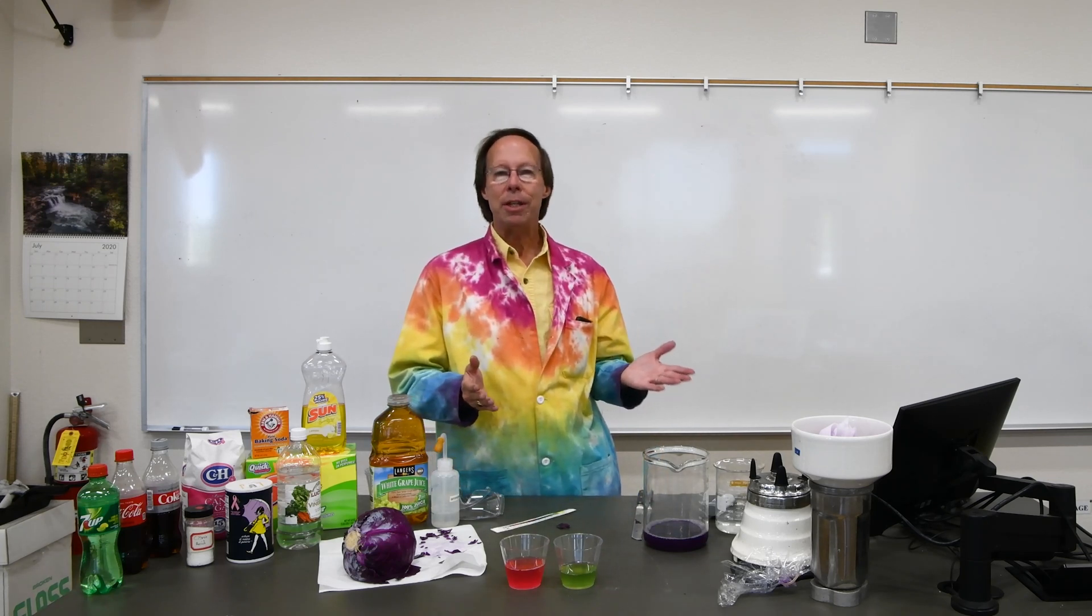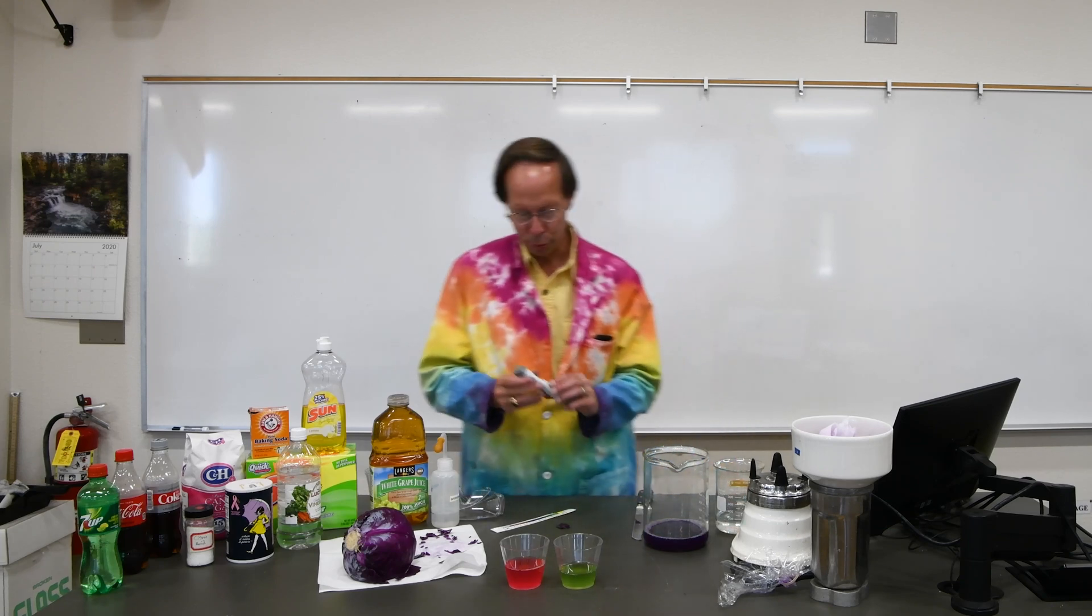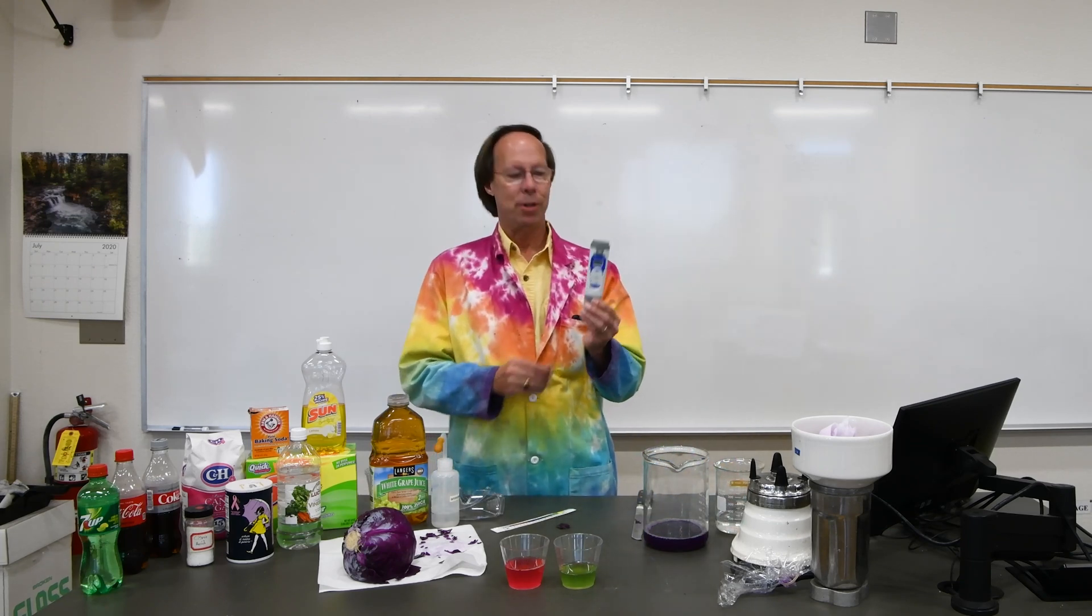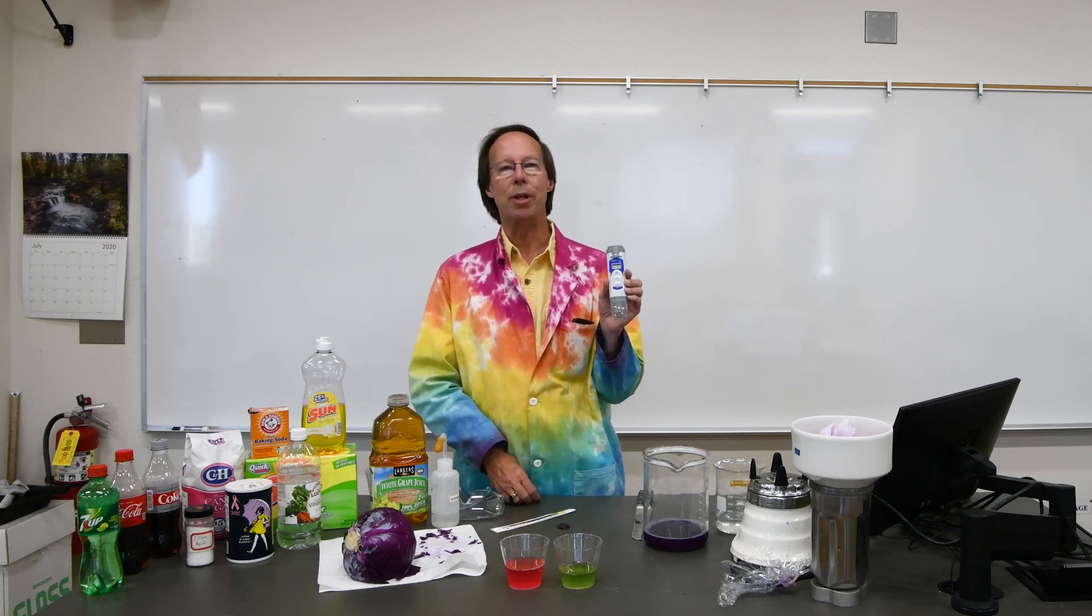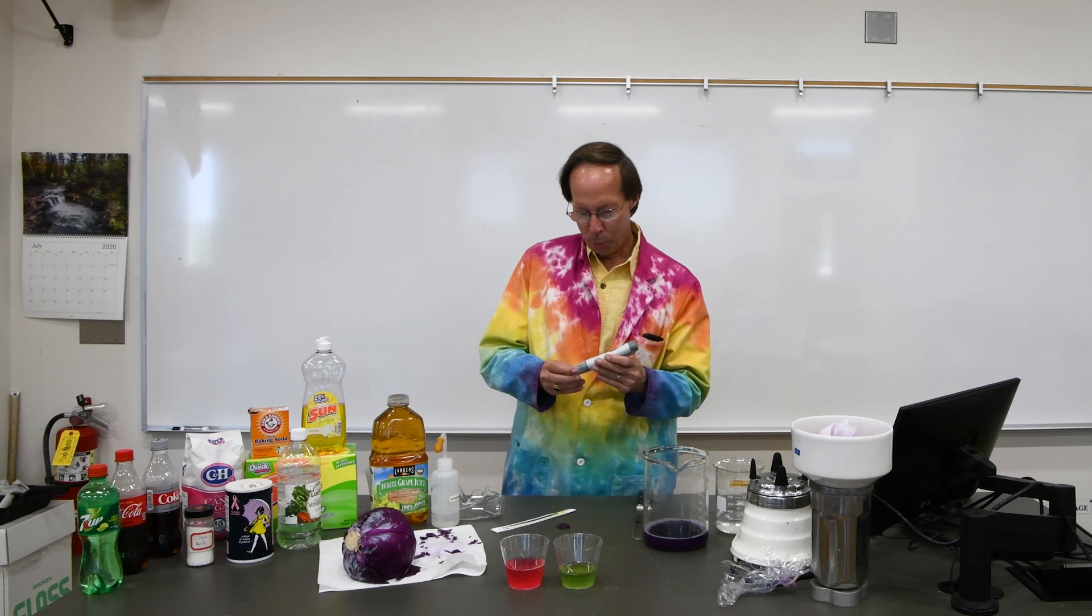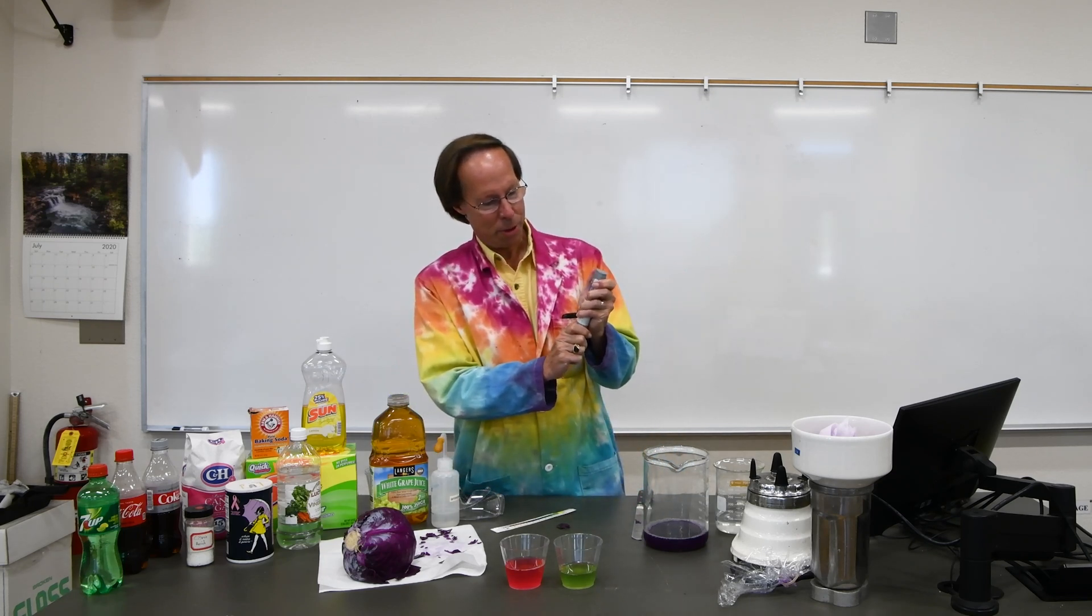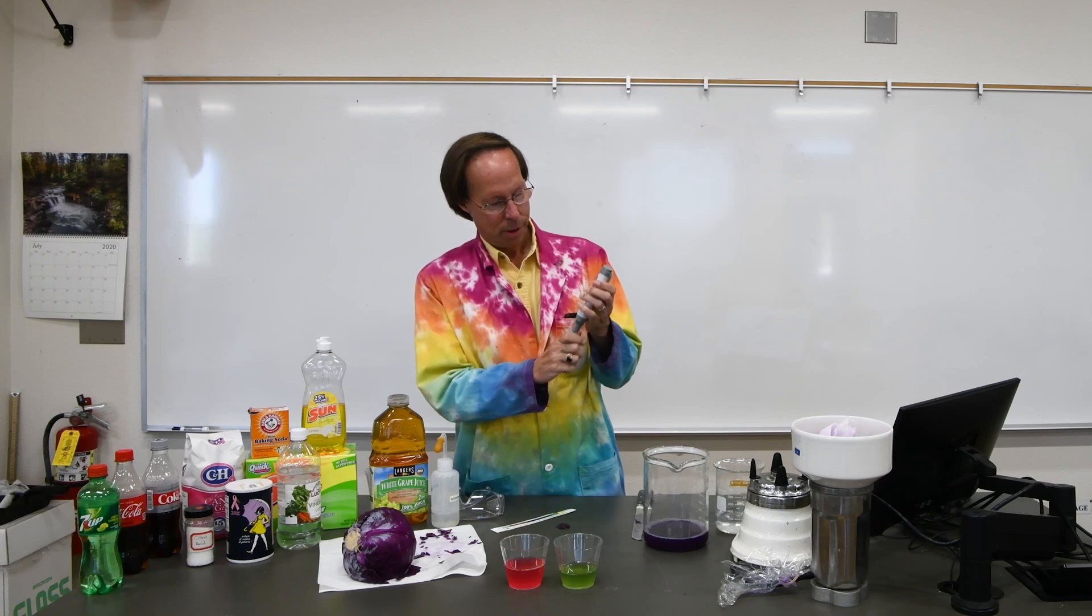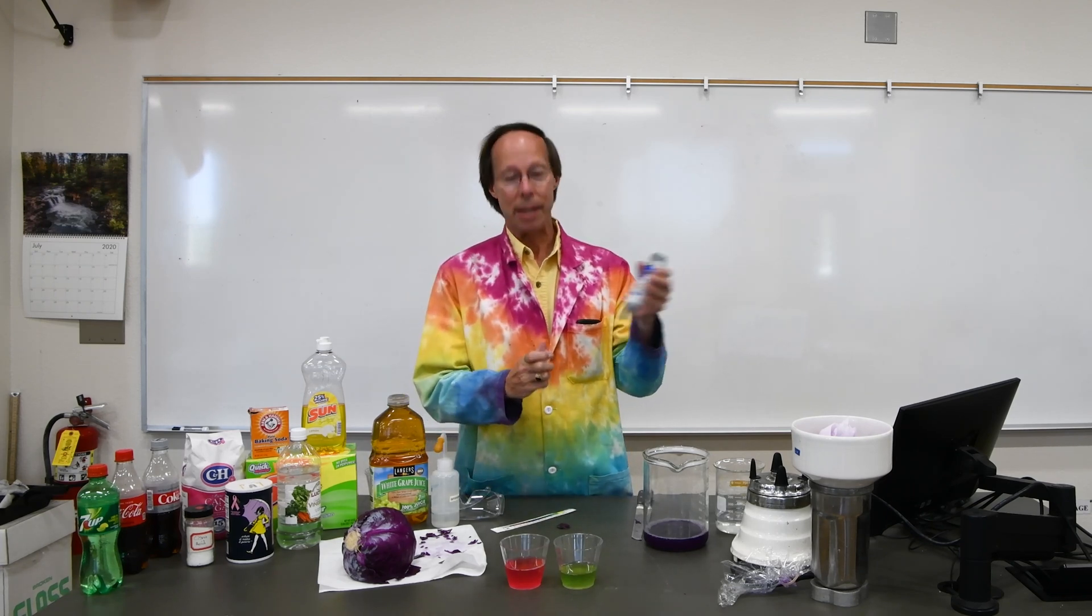After we finish with the 10 cabbage juice tests, we're going to go ahead and test five samples using a pH meter. This pH meter is very accurate. It'll read out to the nearest tenth of a pH unit very easily. And all we have to do is simply take off the cover on the pH meter and immerse the pH meter into our solution and it will simply read out the pH.